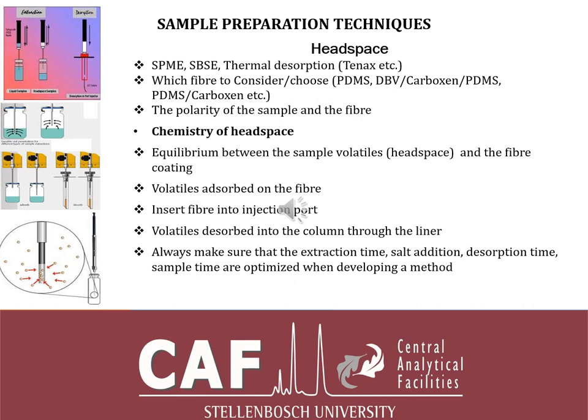We're not going to talk a lot about that, but what I can say is that SBSE stands for stir bar sorptive extraction. From what I can remember, it was developed by Pat Sandra and a student who was doing extraction for volatile compounds. When they injected on the instrument, they either lost the compound of interest or the sensitivity was too low. The student was panicking, and Pat Sandra asked, what are the chances that the compound of interest might be retained on the stir bar, the magnetic stirrer? They took that magnetic stirrer, put it in another solvent, spun it in the solvent, took the solvent and injected it.